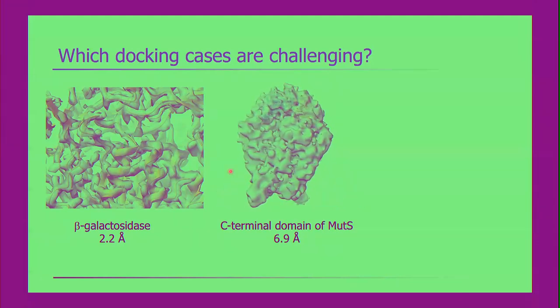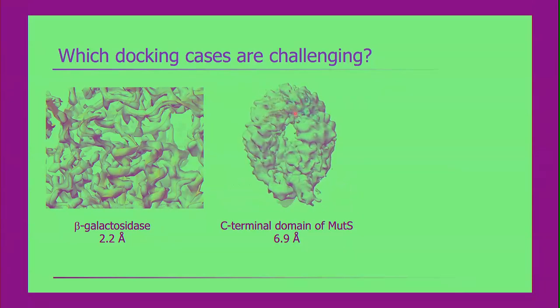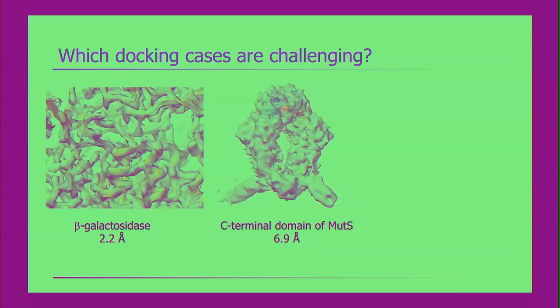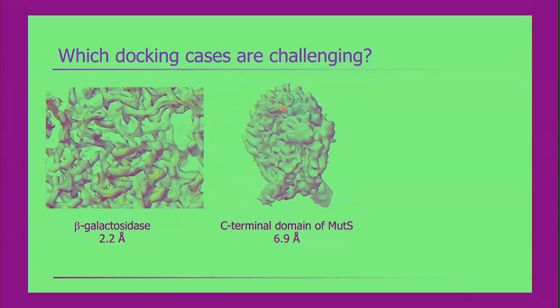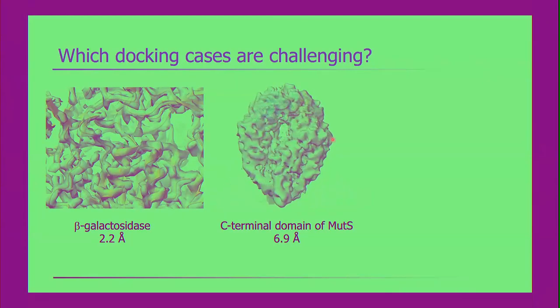But if you know the structures of the components, and what I've chosen here is just to dock 2 copies of a small domain that's only part of the structure, that's harder, that's more useful. It actually turns out to be reasonably straightforward, which is nice.